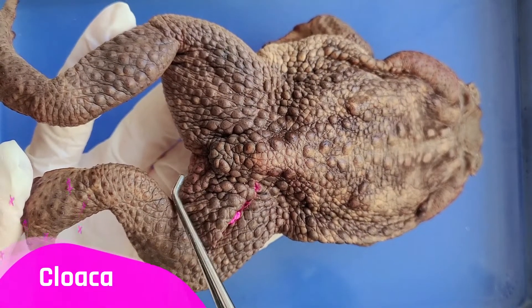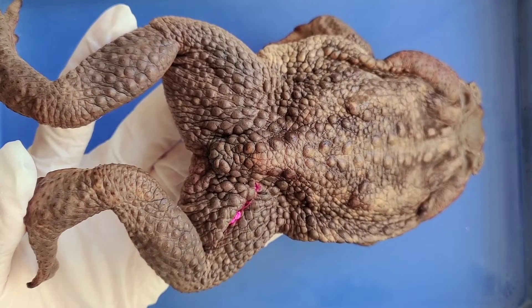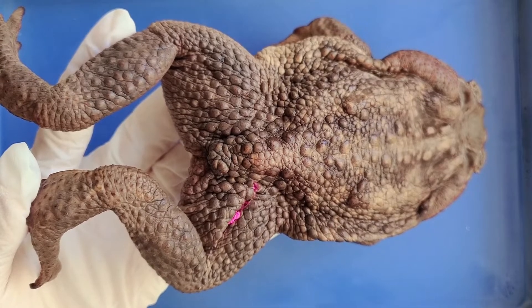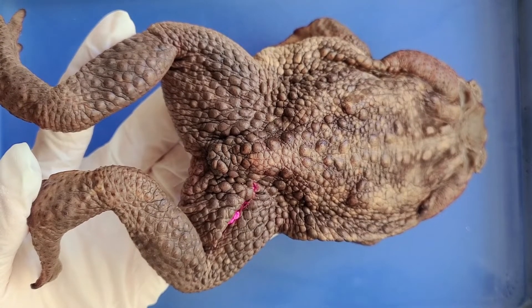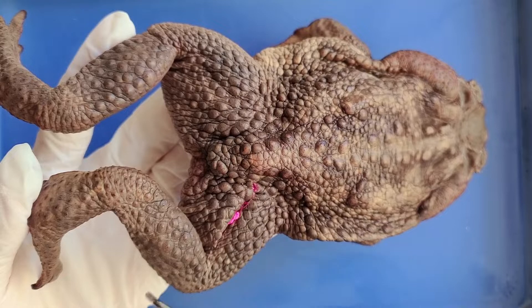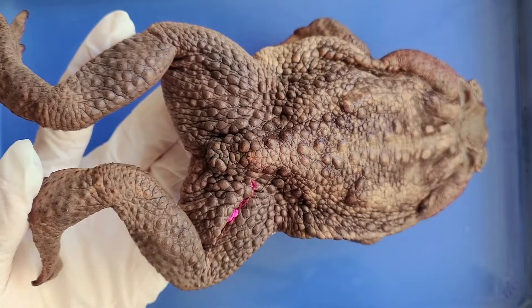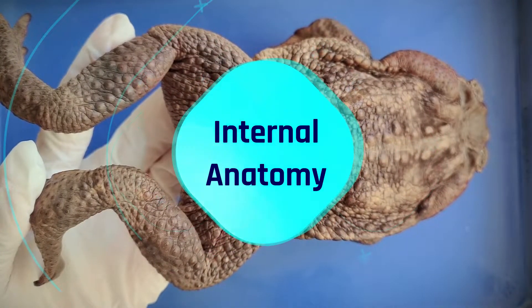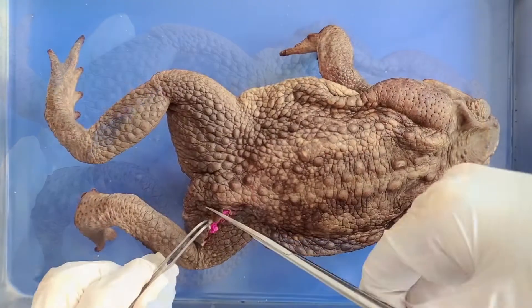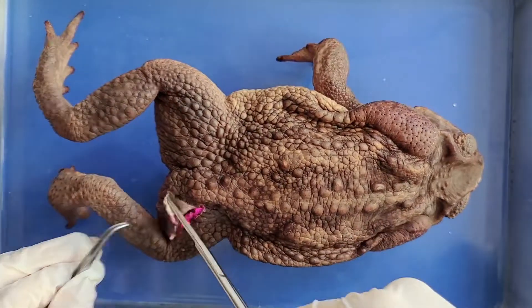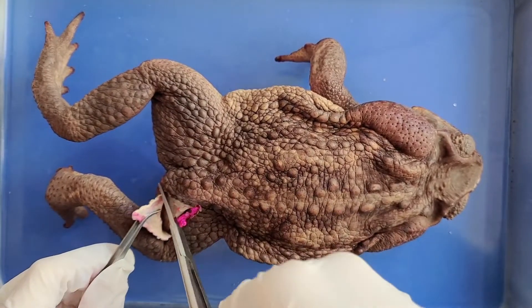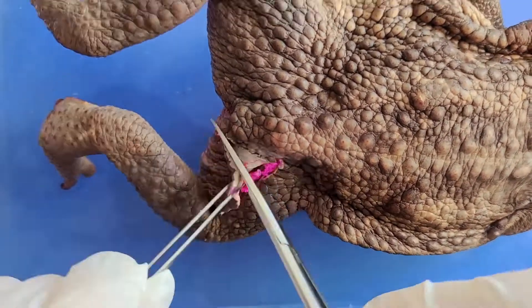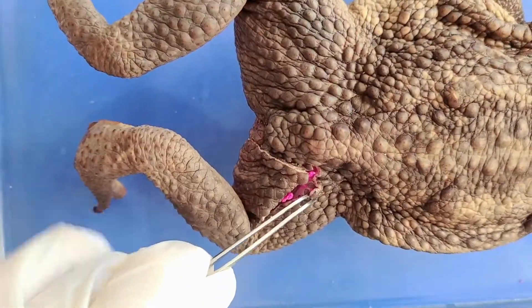On the posterior side of the toad we have the cloaca, which is the exit for the digestive and urogenital tract. We can't really tell if this toad is male or female right now, but we'll see when we open the abdominal cavity. Now let's take a look at the internal anatomy. Take a pair of scissors or a scalpel and carefully cut the skin off one of the legs — make sure to angle the blade up so that you don't cut into the muscle underneath.